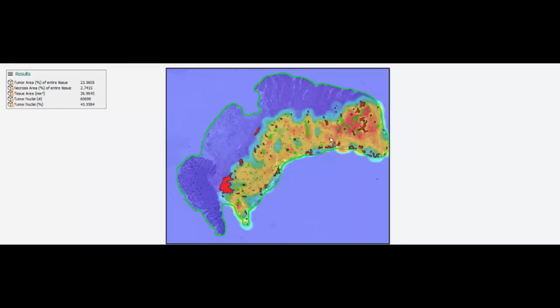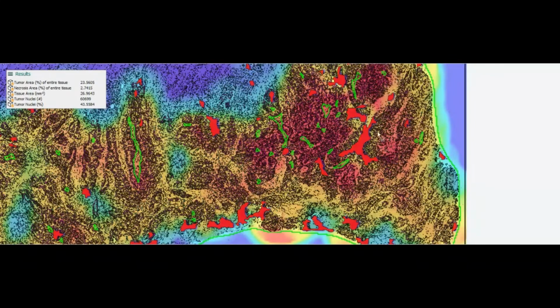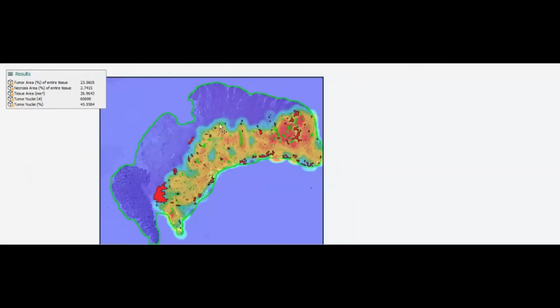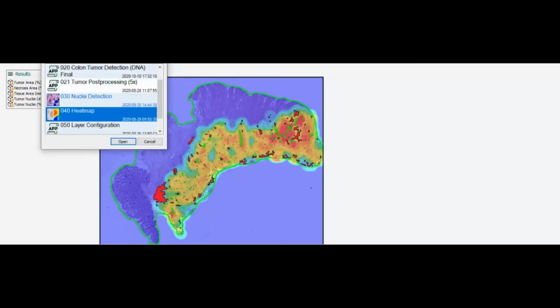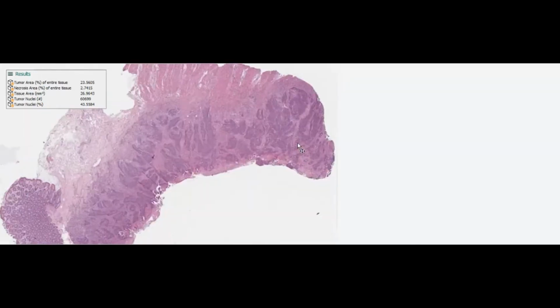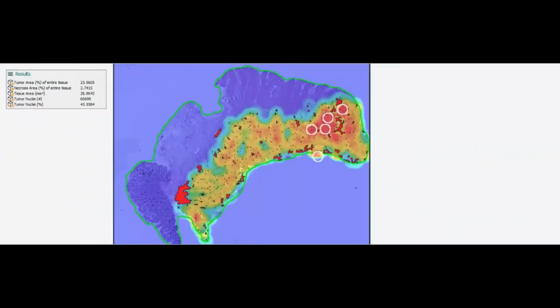The pathologist then can analyze the stained tissue slide using either a microscope or a digital scanned image, or else run the H&E slide through a digital scanner and allow the whole slide to be analyzed using a visual imaging software based on artificial intelligence. In this case, the artificial intelligence selects the area of interest, marks the core areas that should be extracted, and overlays the image of the slide with the image of the tissue on the tissue block.